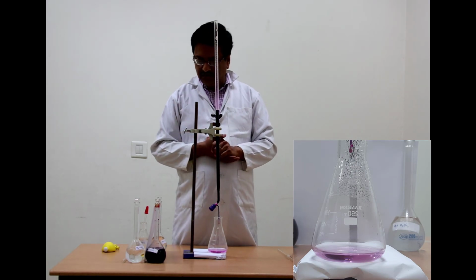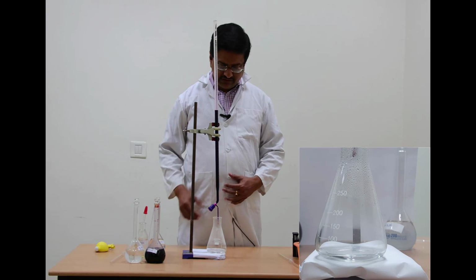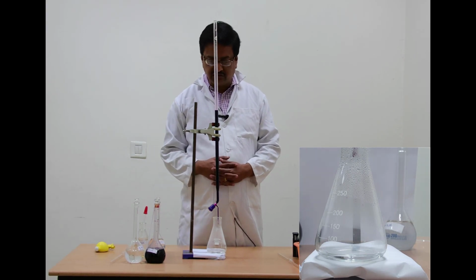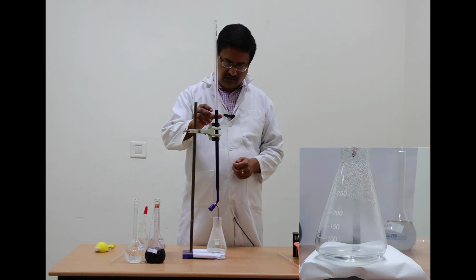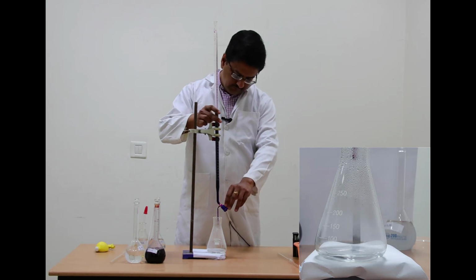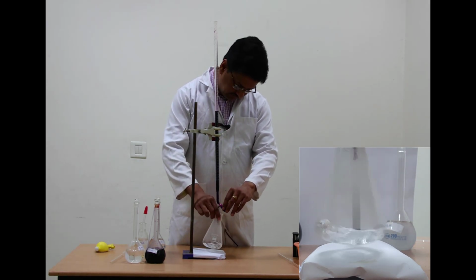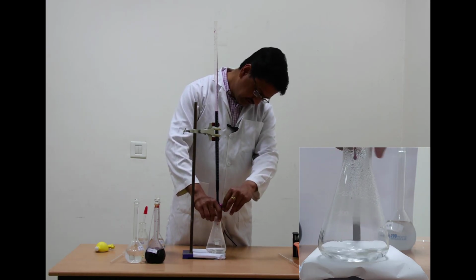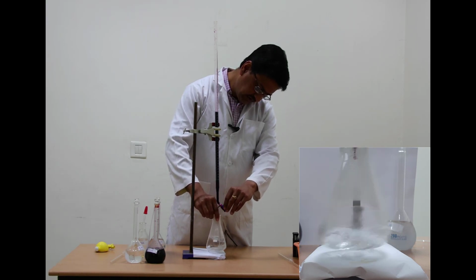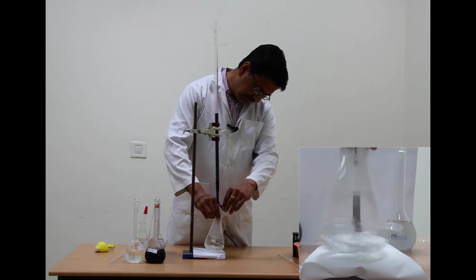So we will do this experiment once again to get the third reading and take the average of these three readings for our calculation. So now again we have taken 10 ml of oxalic acid and 10 ml of sulfuric acid in this conical flask and heated it to about 70 degrees centigrade, and we are going to start this titration once again from 24.1 as the starting burette reading. So again you see that when I add just one drop of permanganate, the color stays for a while and then disappears. And now on adding every drop, the color is disappearing immediately. So it is well established that the Mn2+ that is getting generated during the reaction is catalyzing this reaction.